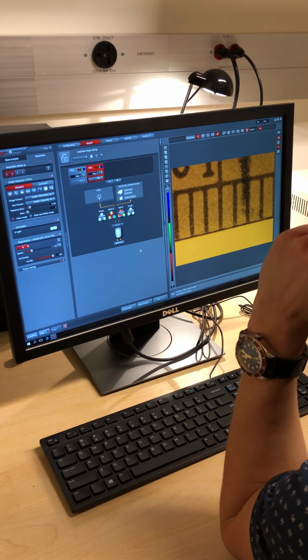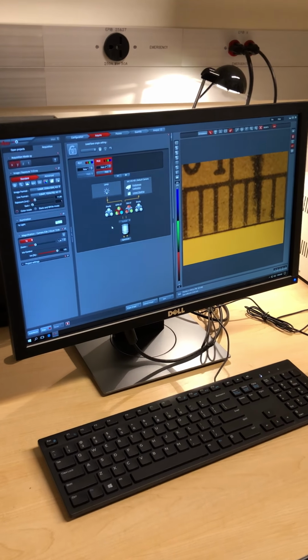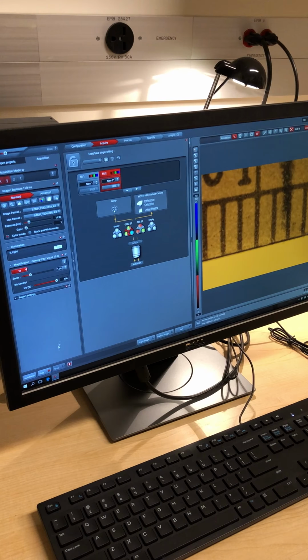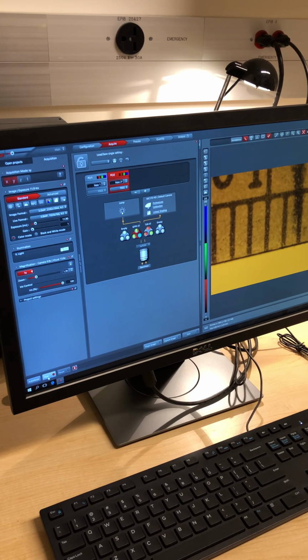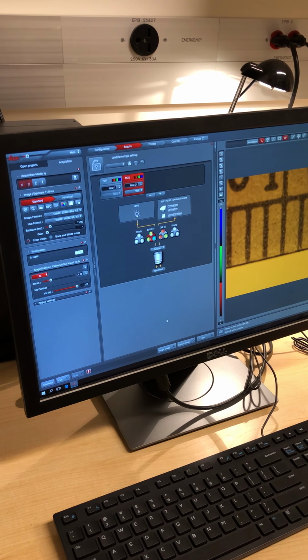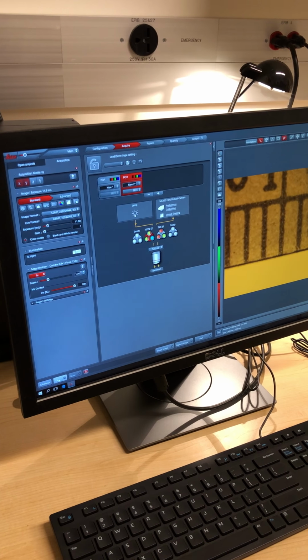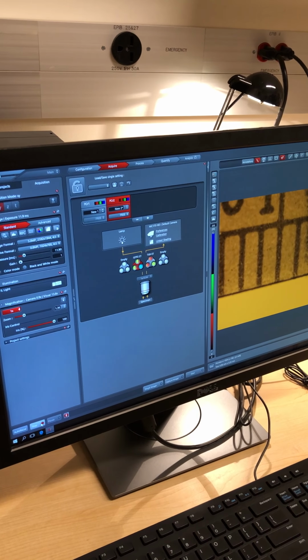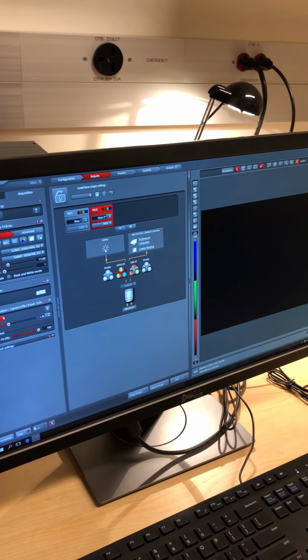All right, so LASX. In this case, the only thing he did when you were not here is just press live. If you see black, it's because this one is in, so just take it out. If you click live, you see nothing. That's probably just because this is in.